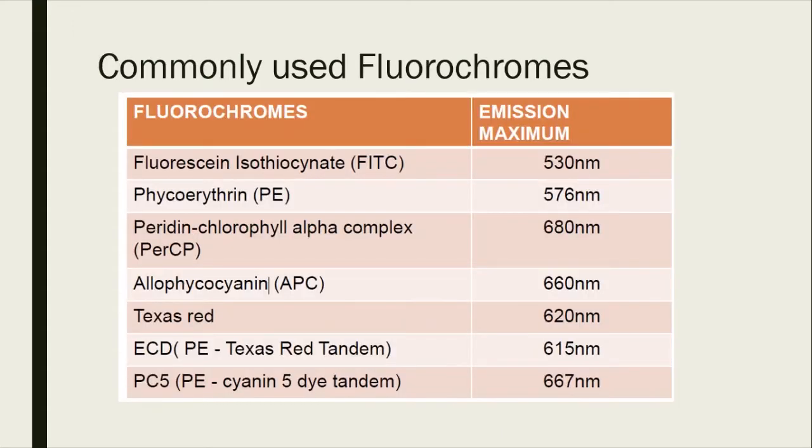Alright, so what are these commonly used fluorochromes? This is FYI. You don't need to memorize tables, never memorize tables. Here, just to show you, we have different colors, different spectrums, for it to generate signals. We have something in the red spectrum, something in more of a blue-green. For FITC, it's a blue-green spectrum there.